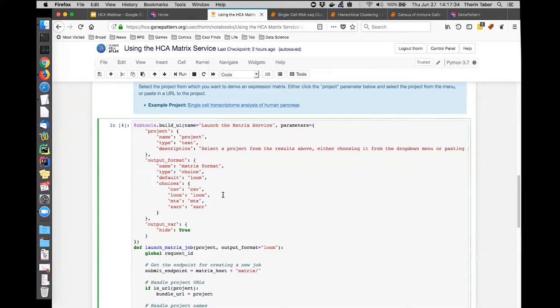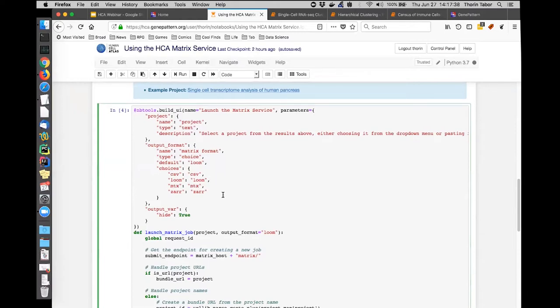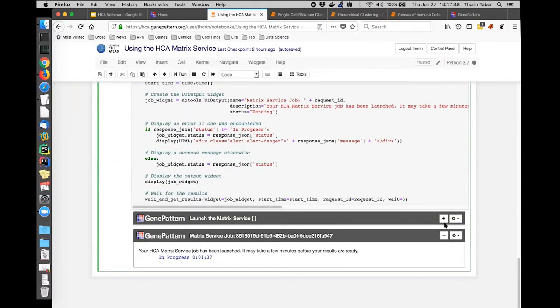The UI builder has a lot of features and options. I could probably run a whole workshop on it alone. But regardless, all of its documentation is up on the website. Right now, the UI builder is Python specific, but we have an R version that is not quite released yet. But it's in the testing phase and should be out in the near future.